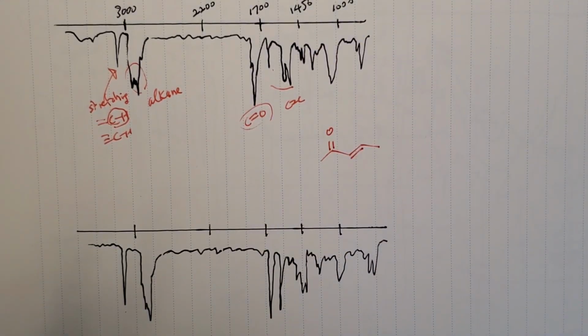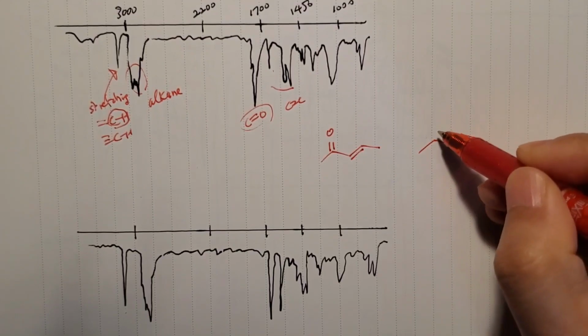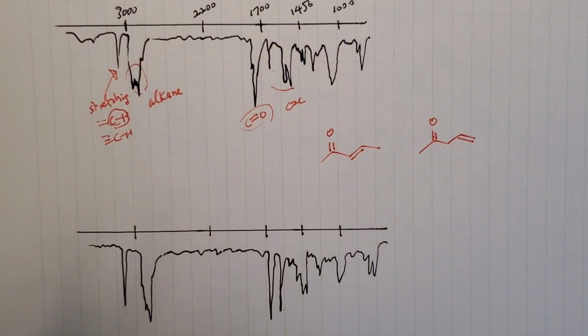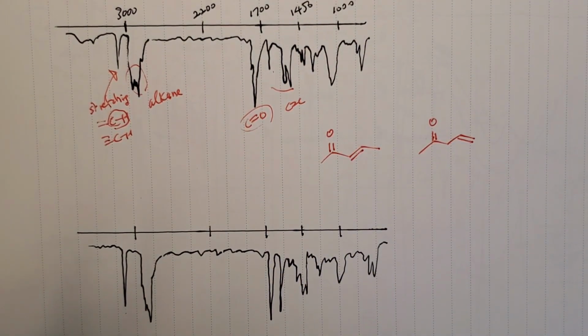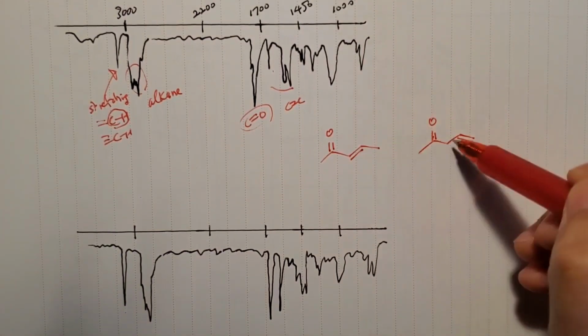And you can think of an isomer sometimes when you run a reaction, right? You have a carbonyl group, and you can have alkene. Then can you assign which spectrum belongs to which compound? And again, you can look at the structure and find out.